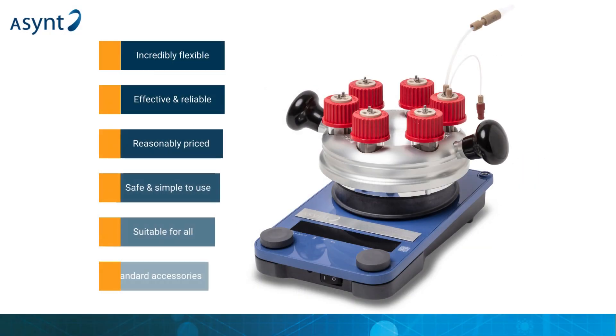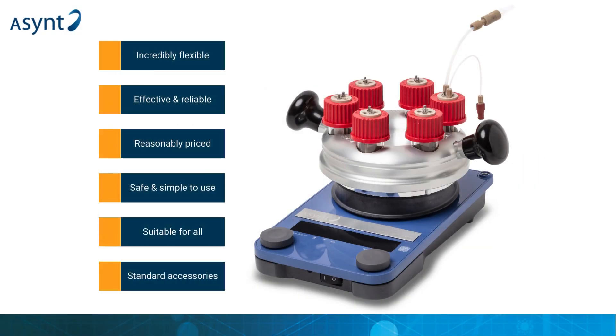The ElectroReact was designed to alleviate customer frustrations with a limited electrochemistry equipment market, its purpose being to provide a simple method to achieve a wide range of customer goals. It's reasonably priced, incredibly flexible, and safe and simple to use effectively, with feedback from those who've trialled it for us very positive. There's of course potential to expand the range in future as well, depending on customer demand.